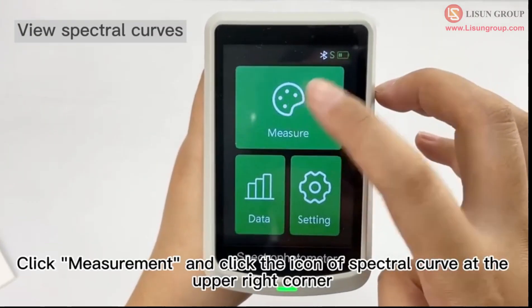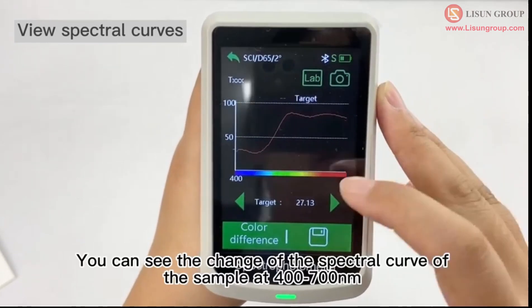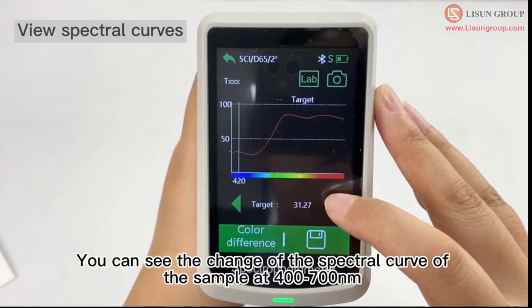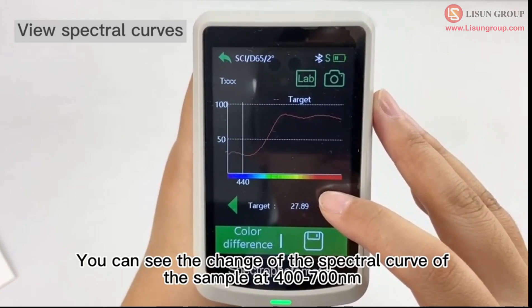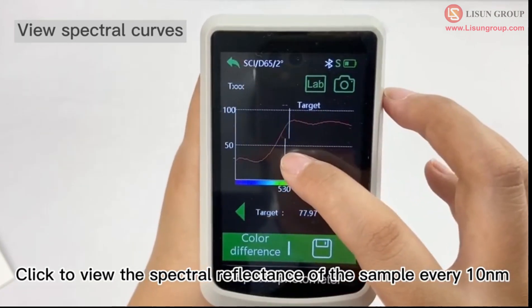Click measurement and click the icon of spectral curve at the upper right corner. You can see the change of the spectral curve of the sample at 400–700 nm. Click to view the spectral reflectance of the sample every 10 nm.